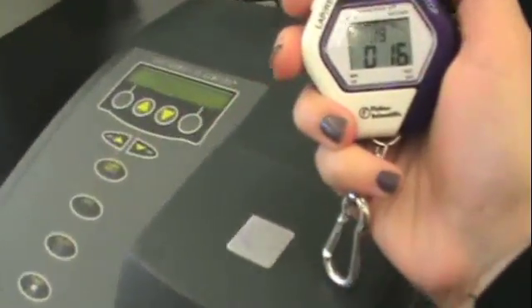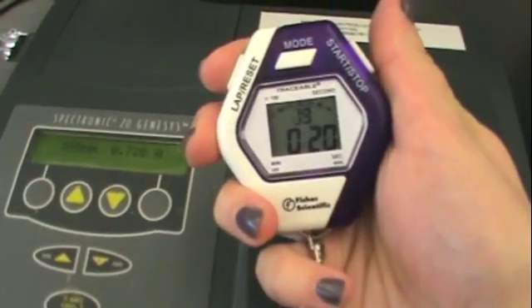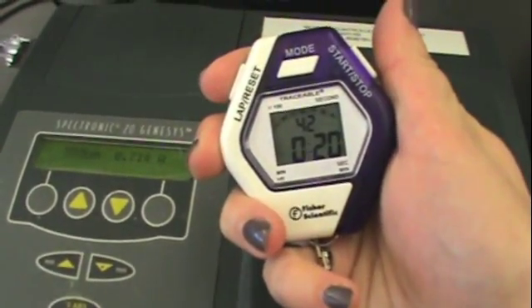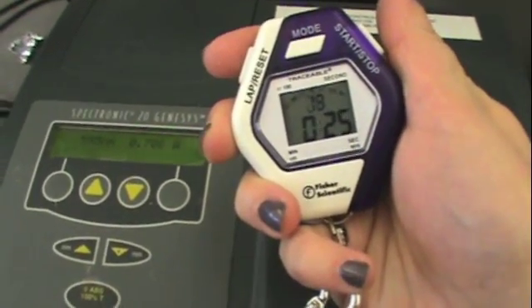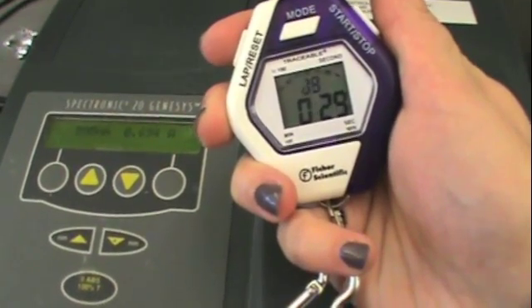When the stopwatch hits 20 seconds we're going to press the lap button and read the absorbance. We see that at 20.42 seconds the absorbance was 0.717. When we press the lap button again, the stopwatch has kept counting.